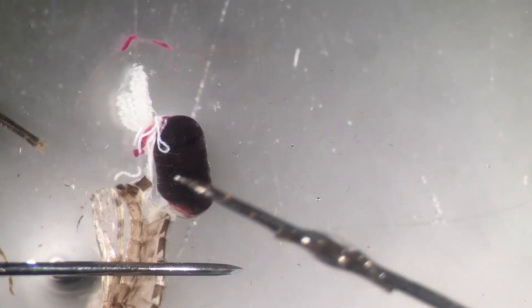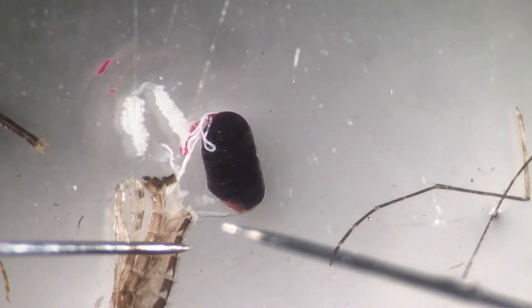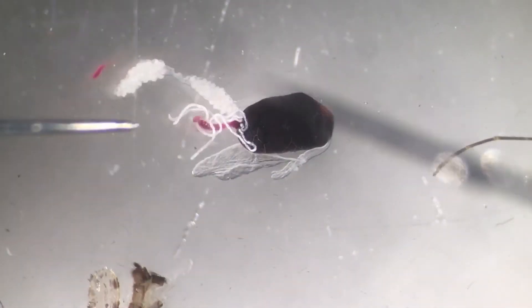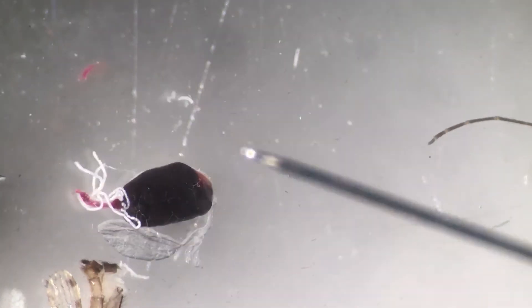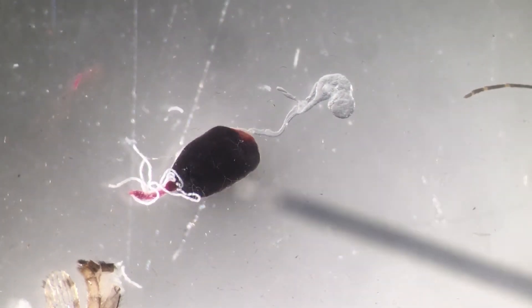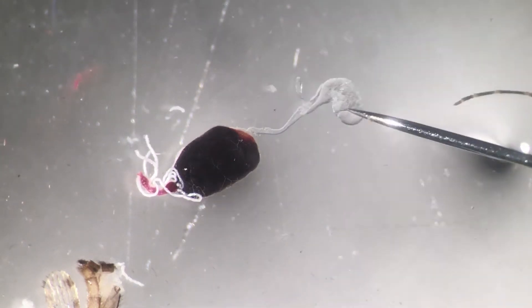These are the ovaries - these are the developing eggs. Let's push that out. There's a bit of blood there, but that is the midgut. Let's get rid of the eggs - well, they're not eggs yet, these are oocytes or developing eggs. Let's put them to the side.